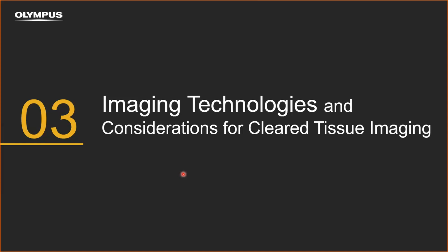Thanks for your wonderful talk, Tim. In his talk, Tim mentioned that for your experiment to be successful, sample clearing and imaging technologies must be compatible. We'll now delve into the imaging side of it.